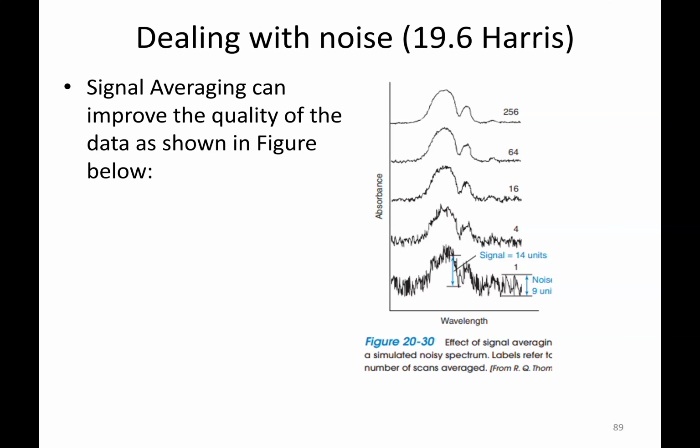Each of these is a spectrum, like we have said: 1 spectrum, 4, 16, 64, 256, and so forth. And notice here, this is the noise. Can you see that? You want to measure it; that is the noise level.